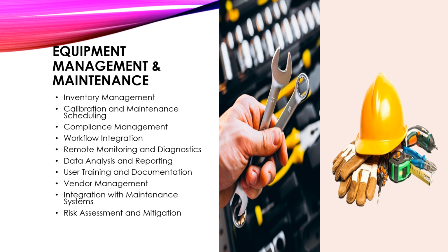Remote monitoring and diagnostics. Some advanced laboratory management systems offer remote monitoring capabilities, allowing users to monitor equipment performance in real time and receive alerts for any deviations or malfunctions. Remote diagnostics may also be available to troubleshoot issues without the need for on-site intervention. Data analysis and reporting. The system should provide tools for analyzing equipment performance data such as uptime, downtime, failure rates, and mean time between failures. Reporting capabilities enable managers to make informed decisions regarding equipment replacements, upgrades, or repairs.